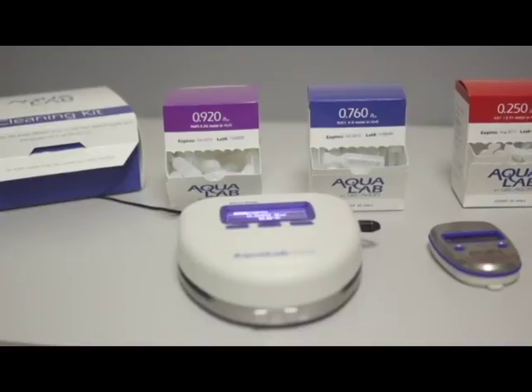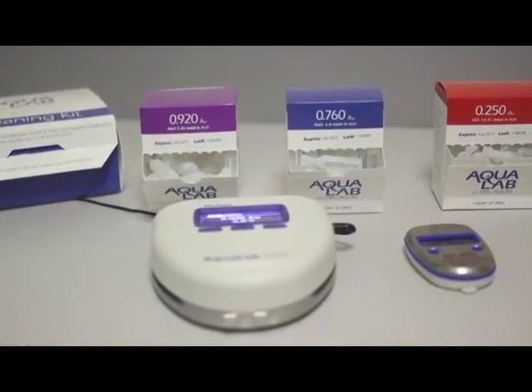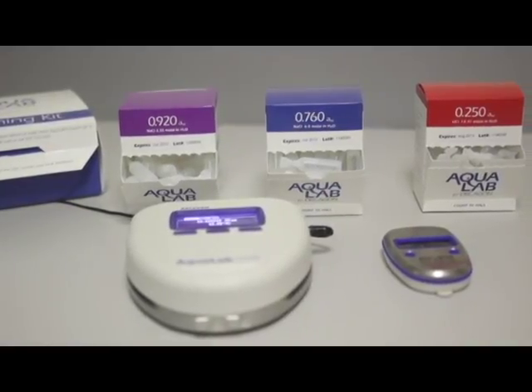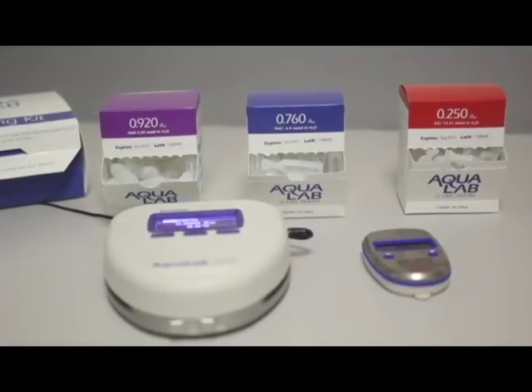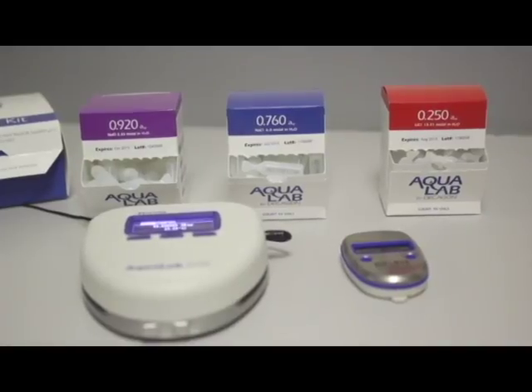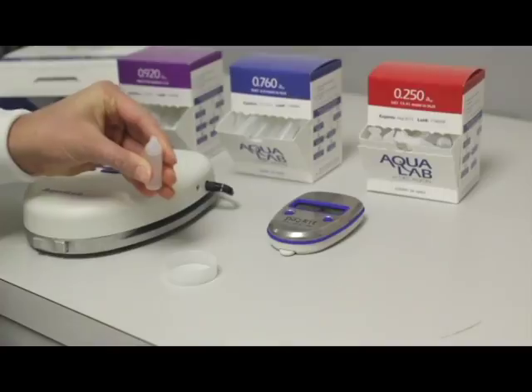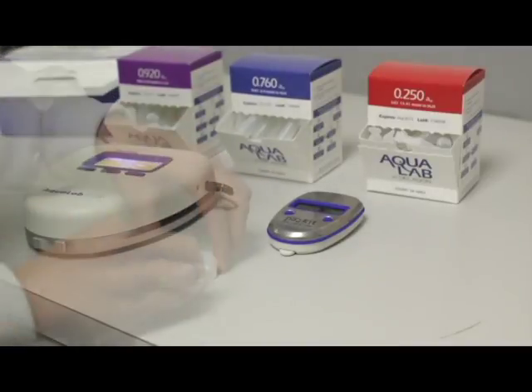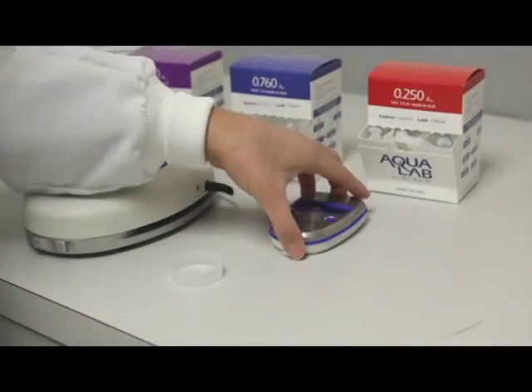After cleaning and before testing product, you need to verify your instrument with two verification standards. With the pocket and the light, there are only three verification standards out of the six we sell that you should use. The three standards are the 0.920, the 0.760, and the 0.250. You always want to use the 0.760 standard first, no matter what you are testing. You break open a vial of the 0.760 and pour it into a sample cup.